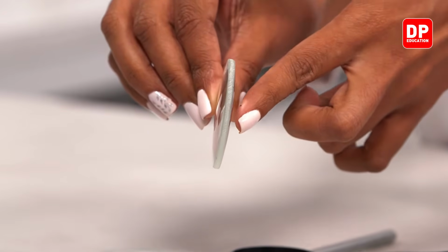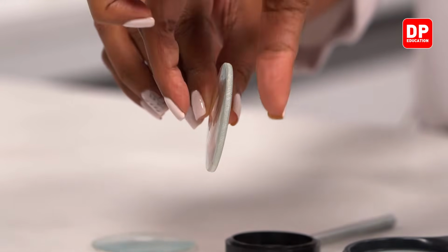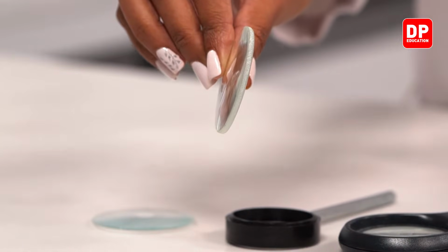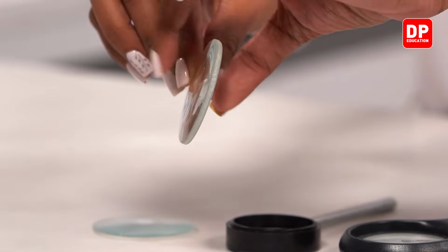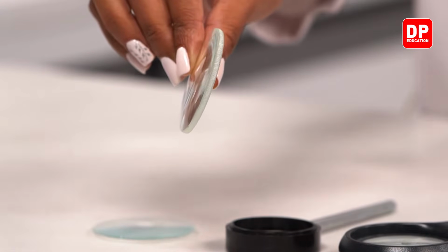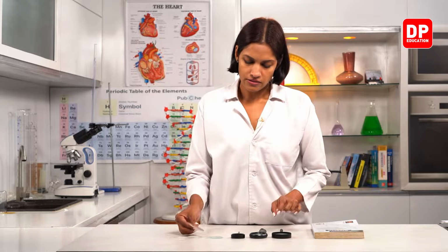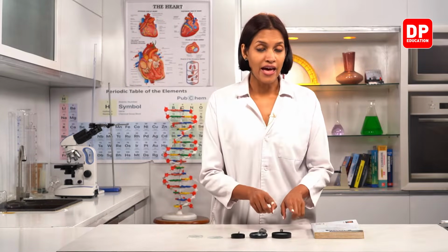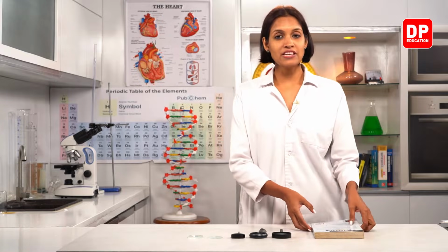Right, children? So they are curved outwards. If you observe these two parts, you can see it is thicker. The middle part is thicker than the edges, right? Right, children. So we are going to use a hand lens to read these small letters.